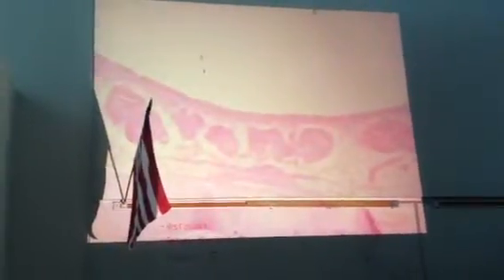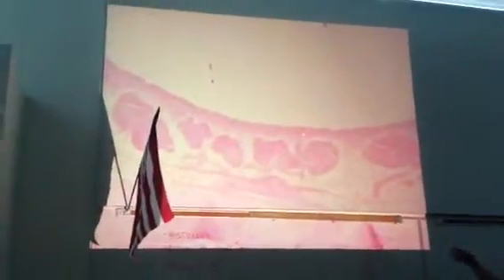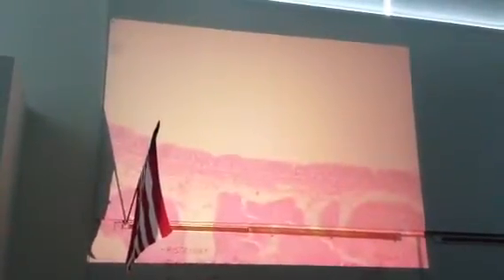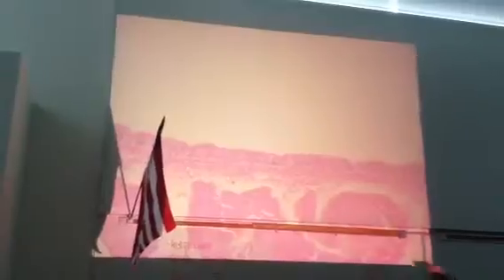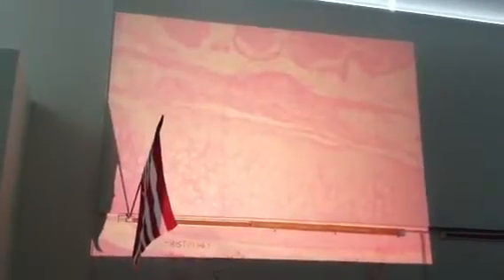So we have the lumen of the trachea up above. This is a pseudostratified ciliated columnar epithelium. Mucus-producing glands here. So I'll go up in power and we'll take a look at it. And then beyond that is going to be hyaline cartilage, C-shaped rings in our trachea. I mean, you can feel them when you go down your throat here.